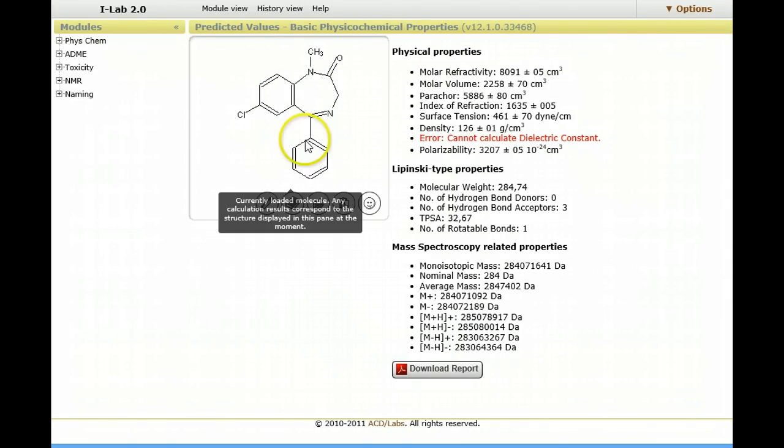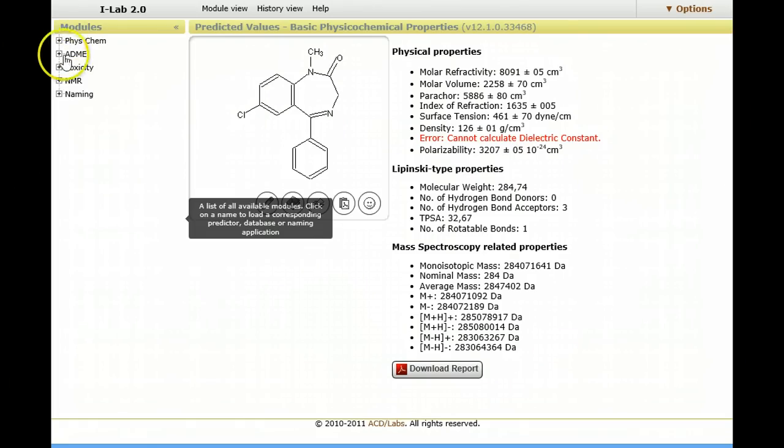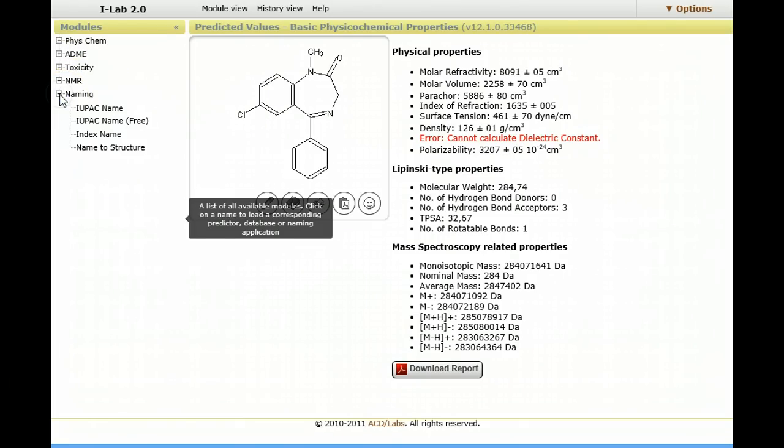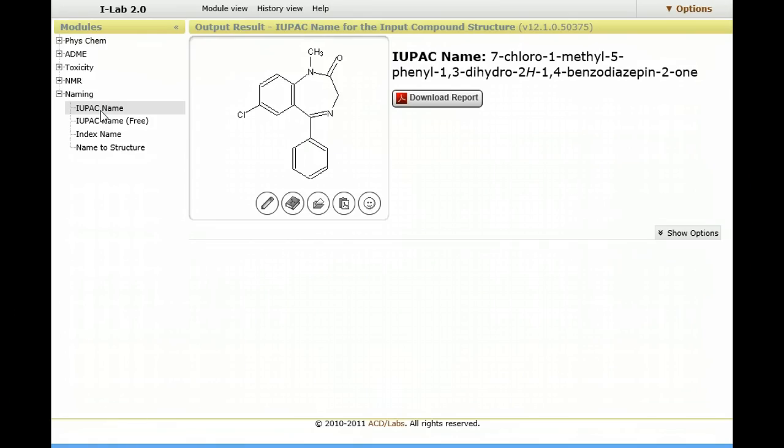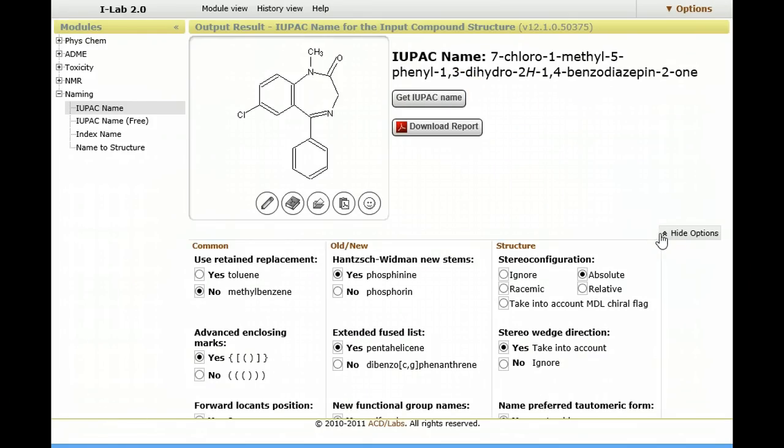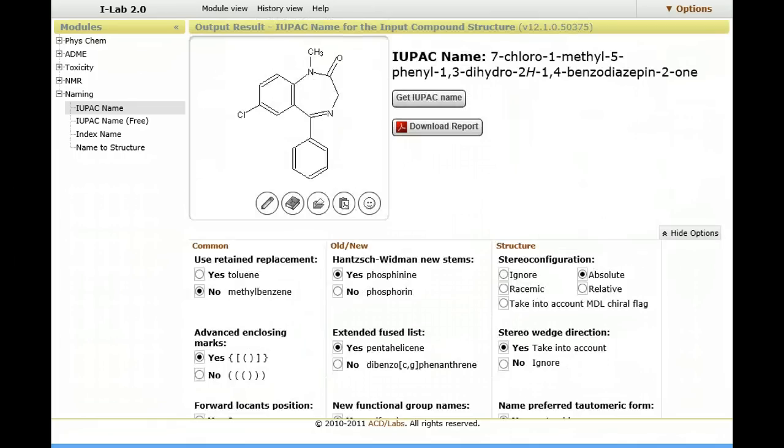Here are some of the properties that it's calculated, and now if you look over on the left hand side you see the various modules. Let's start with something like naming, I want to generate a IUPAC name. Here's the systematic name, I can download the report, there are various options that I can use. Many of these you may not even be aware of in terms of what you can set for generating names. Many of you will simply just want to generate the systematic name.